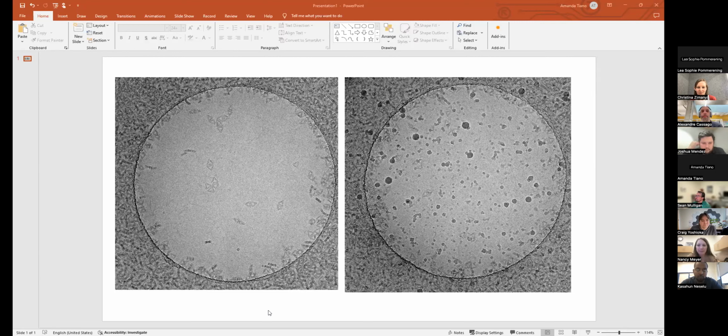We do 90 seconds at positive 30 milliamps, which seems extreme, but it actually works really well for these structures. I've looked at single DNA origamis, and then these are just a dimer type structure, but it works. Thanks.